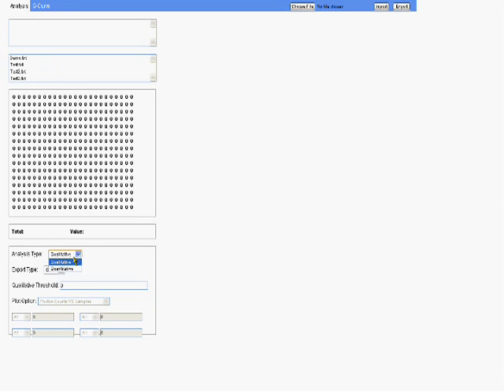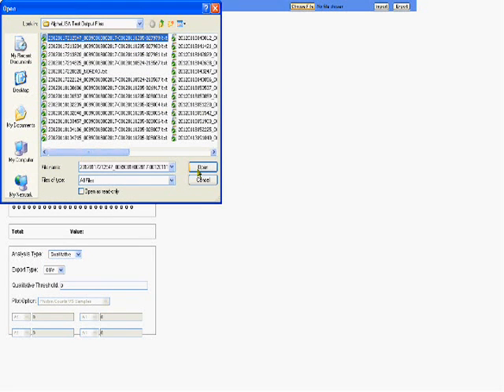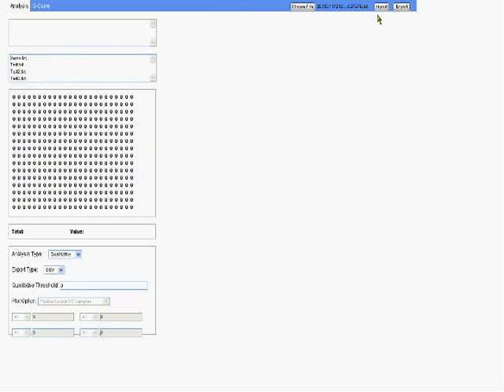You can do qualitative and quantitative graphing. I'll demonstrate both here. First we'll do qualitative. The first thing you'll need to do is choose the files you'd like to work with. So you can choose the file, import it, and we can just show that you can do multiple files here.